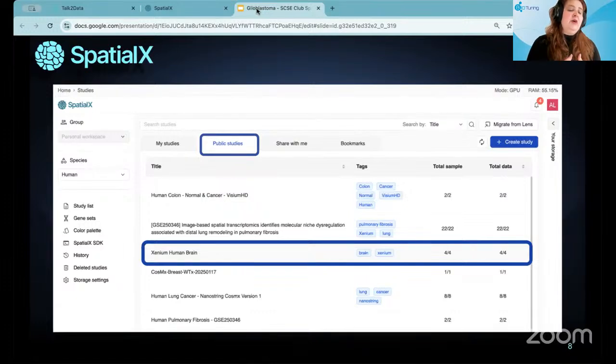This is data coming from adult human cortical sections, and they employ very robust gene expression panels designed to capture the transcriptional landscapes of the image. This might range from healthy, cancerous, or neurodegenerative diseases as well. Particularly, we'll be focusing on the healthy adult human brain cortical sections, and also the glioblastoma tumor core sample, which encompasses the identification of neuronal, endothelial, astrocyte, microglia, and oligodendrocyte cells, as well as other immune cell types that interact with the microenvironment.